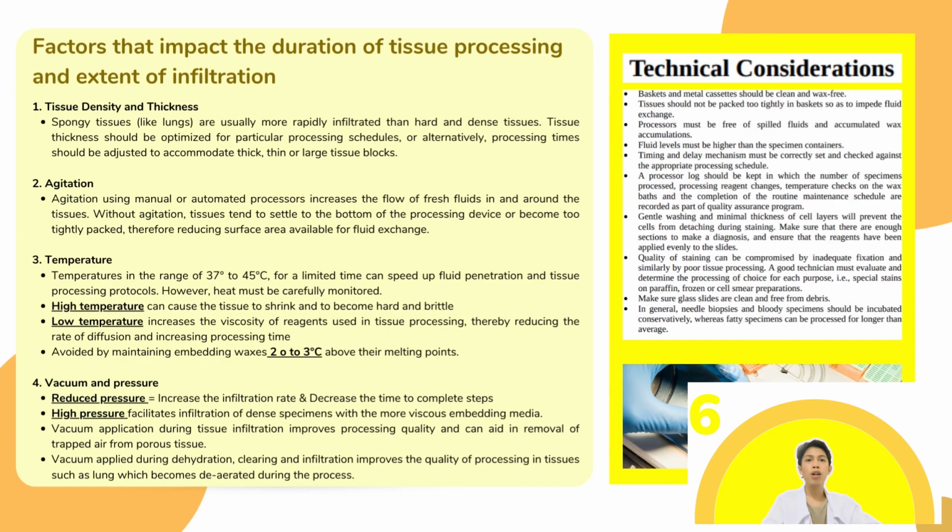So these are the 4 factors that impact the duration of tissue processing and the extent of infiltration. So again, first is tissue density and thickness. Second is agitation. Third is temperature. And lastly is vacuum and pressure. So remember those 4 factors, guys.